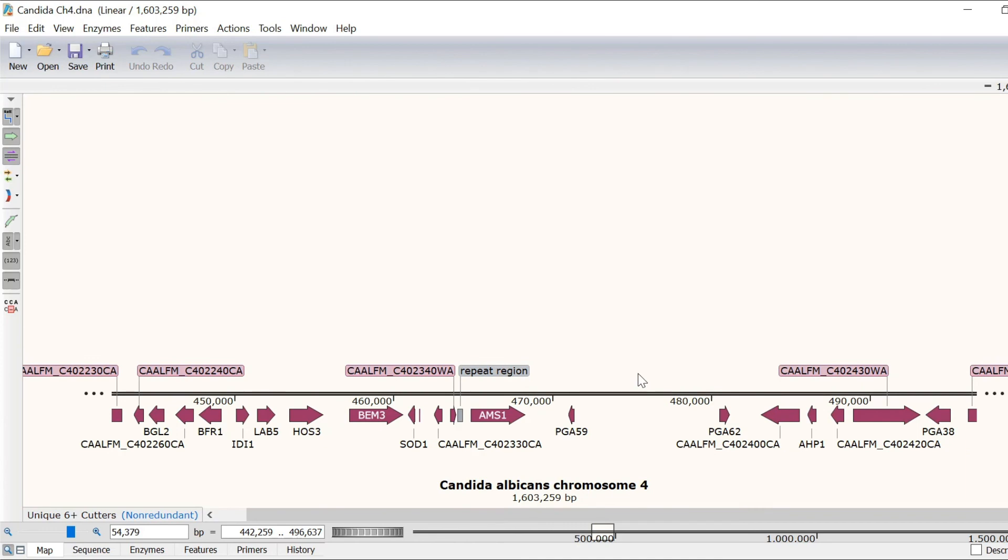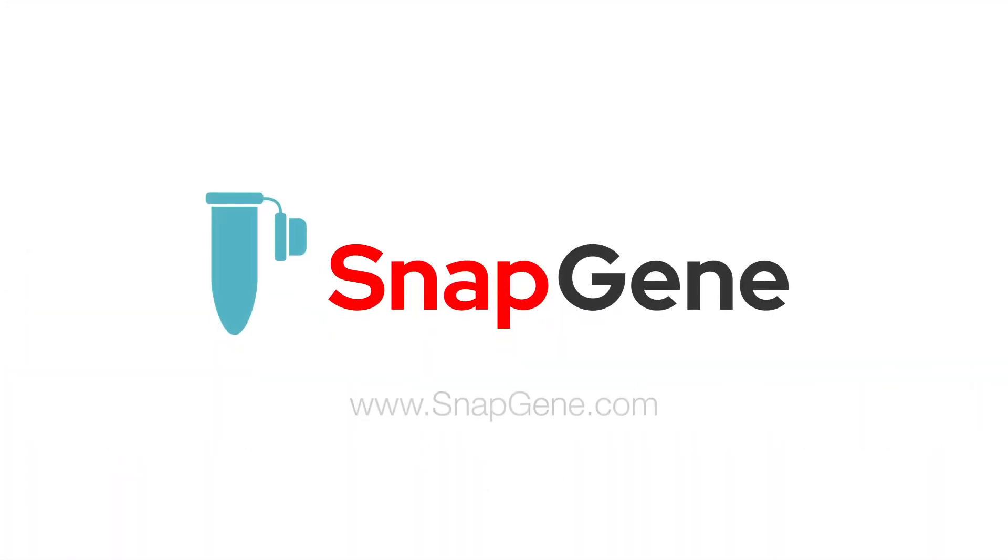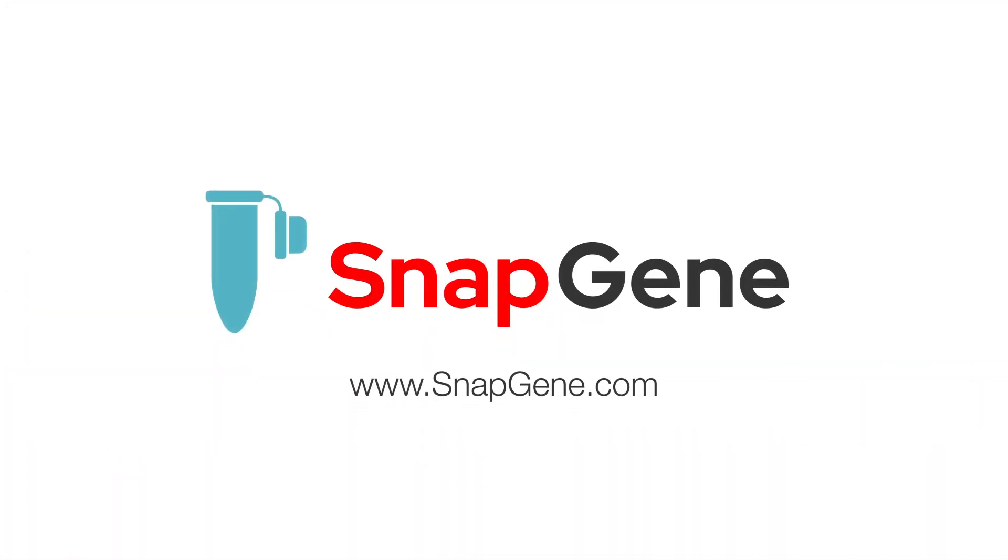So that wraps up this introduction to visualisation features in Snapgene. For more information about simulating genetic manipulations such as PCR and cloning in Snapgene, check out the other tutorials on the Snapgene website.